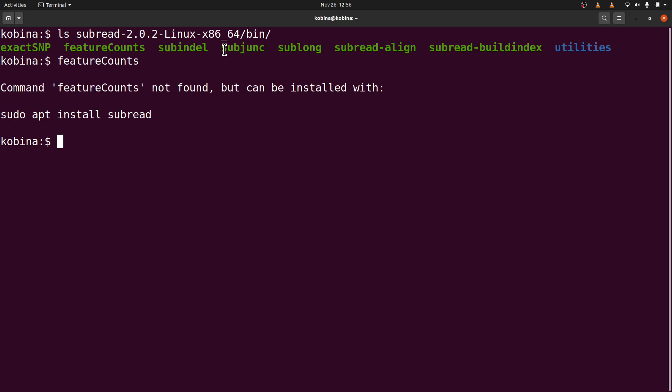But with what we have at the moment, if we do that, we are going to get this error message command not found. So what we are going to do next is to configure our system so that we can only use this name, featureCounts here, to call the binary. And the other binaries for that matter.